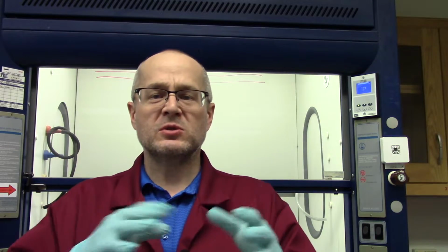Now, the sublimation experiment that you're supposed to do before this Corona closing, you're supposed to do some mixing of chemicals and do a vacuum filtration and all that kind of stuff. Well, you've done all that a million times, so I'm not going to show it to you again. You know how to mix chemicals together. You know how to do it safely. You guys are already really good at this.